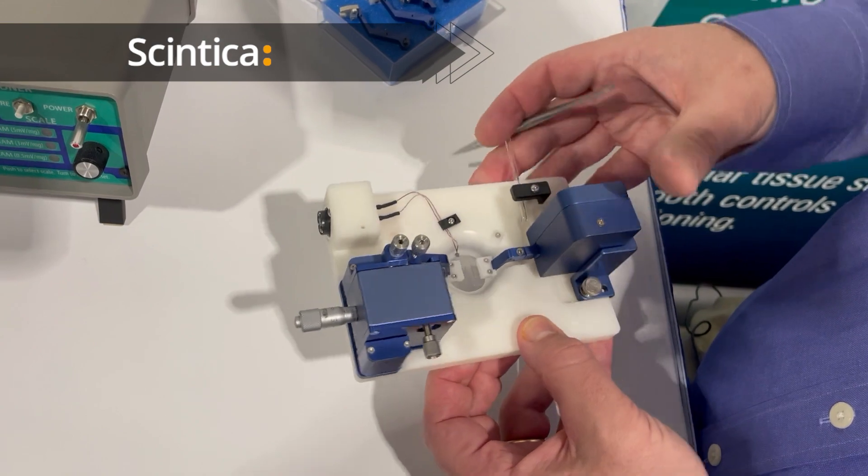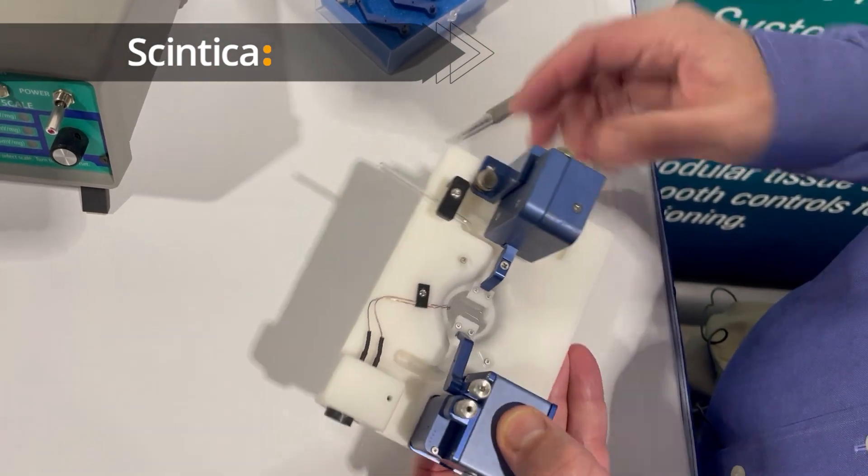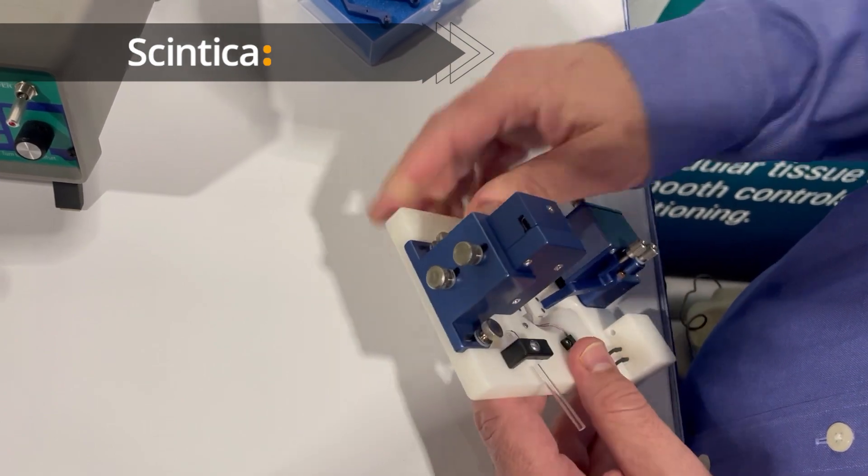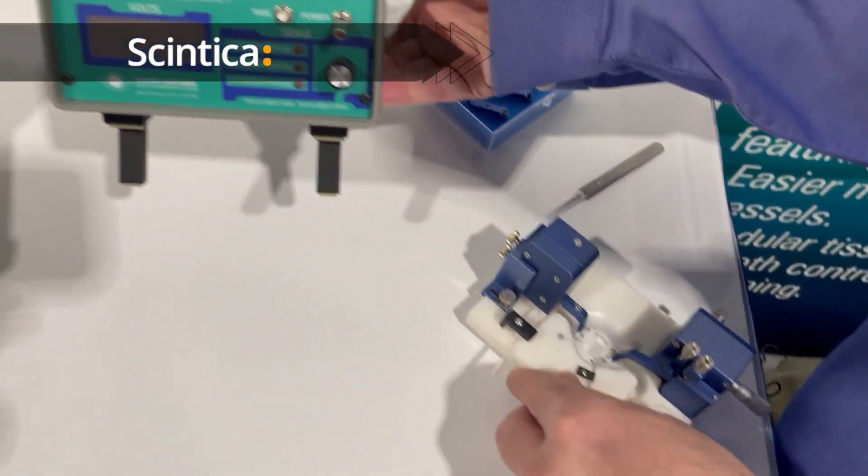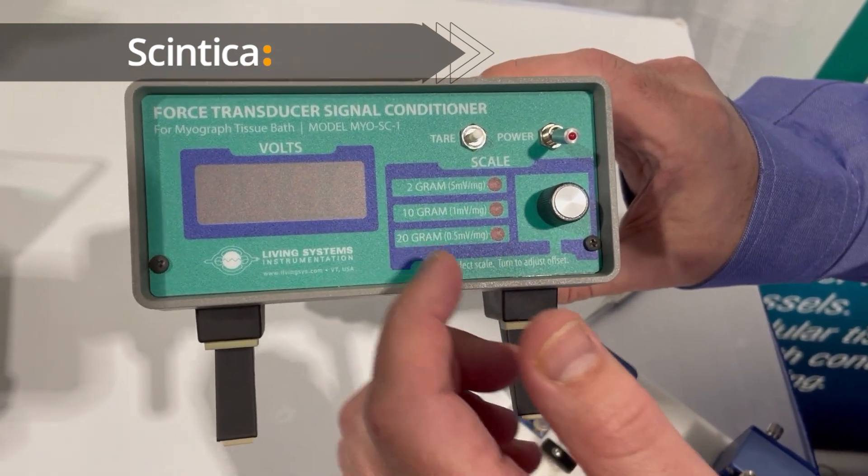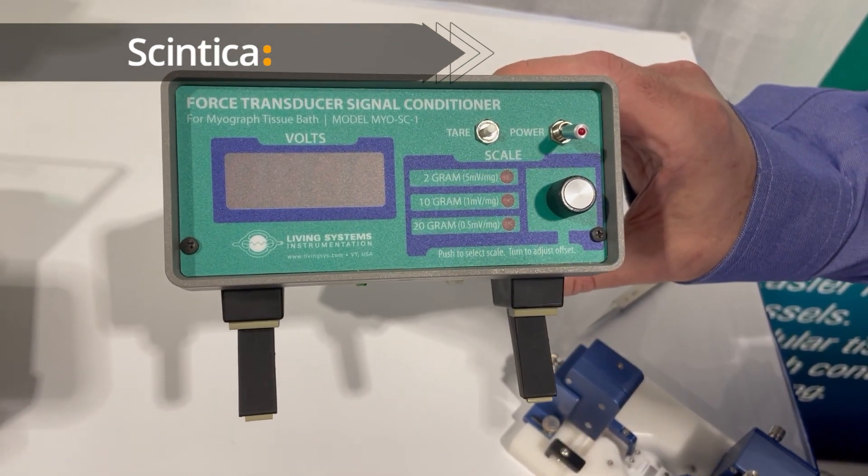The force transducer gets connected by a cable to the signal conditioning unit here. And this is where you adjust the sensitivity that you want to study. We have a 2 gram setting, 10 gram setting, and a 20 gram setting. Those are the full scale outputs.